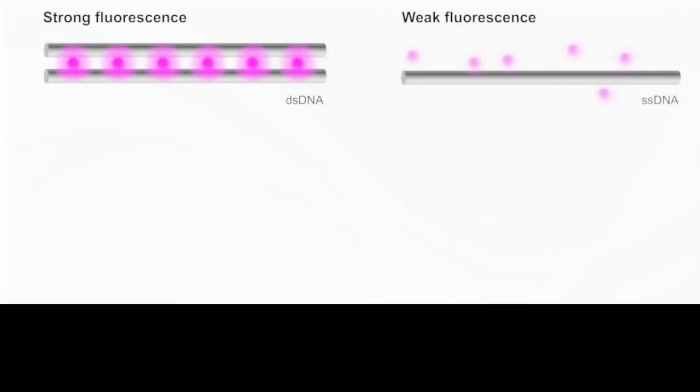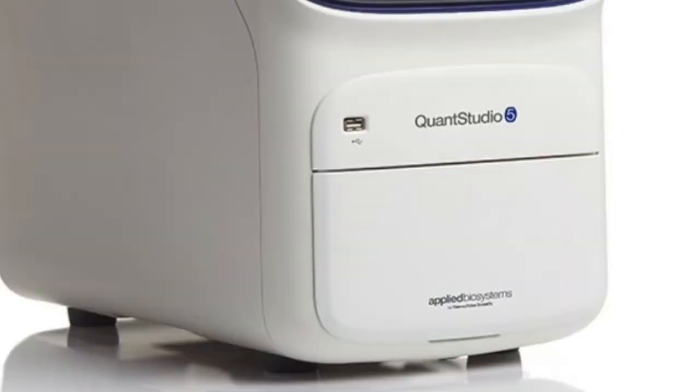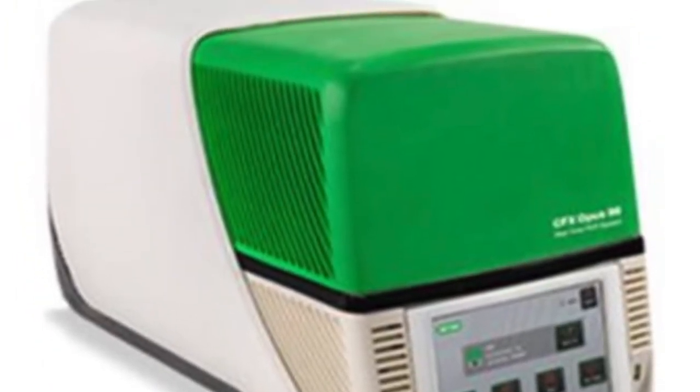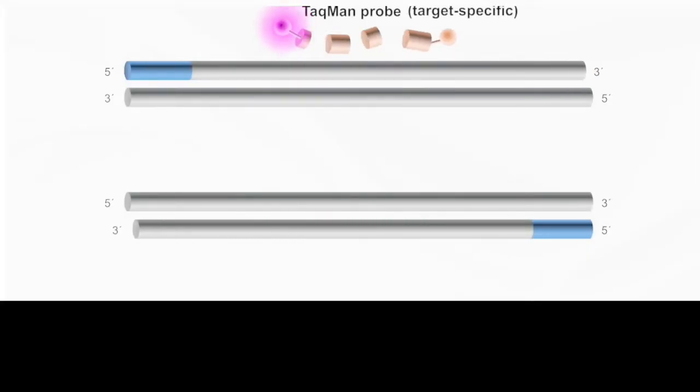So can you do qPCR on a regular PCR machine? Well, actually no. Because you have the additional fluorescent molecule, you need a PCR machine that has lasers to supply the energy that excites the fluorescent molecules. And then you need detectors to record the fluorescent wavelength emitted in response.